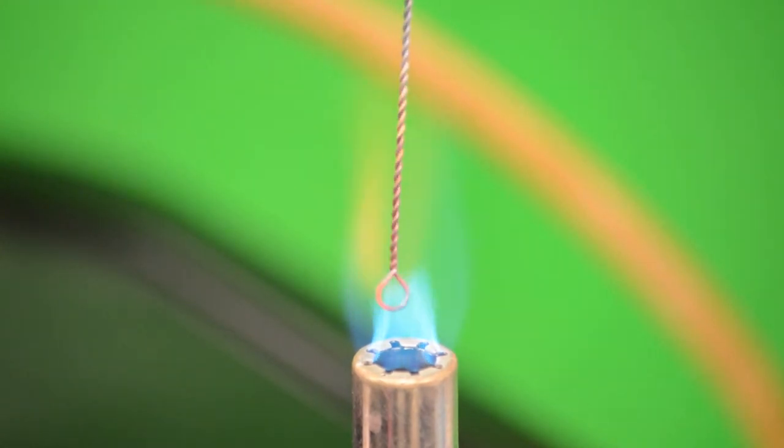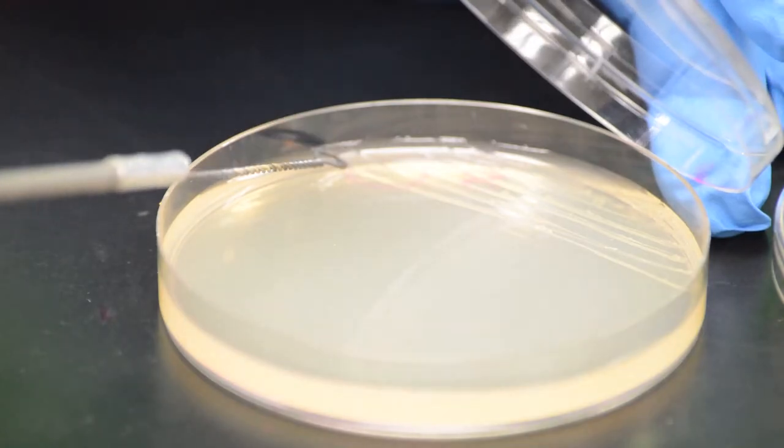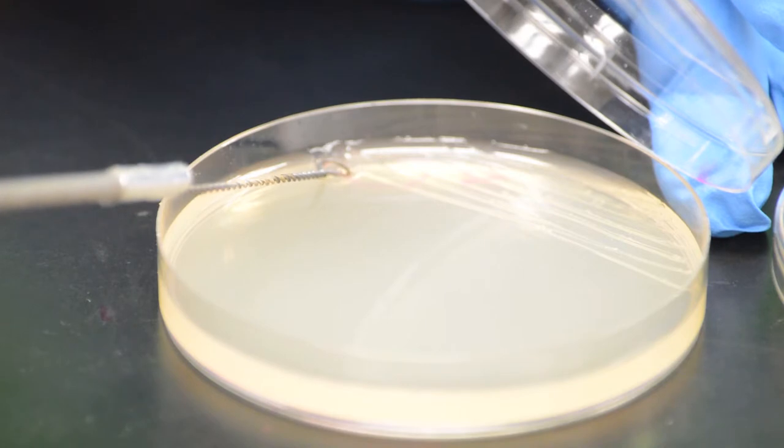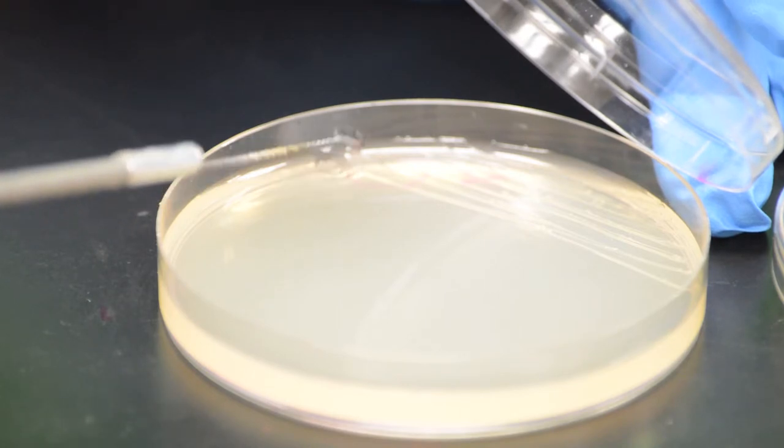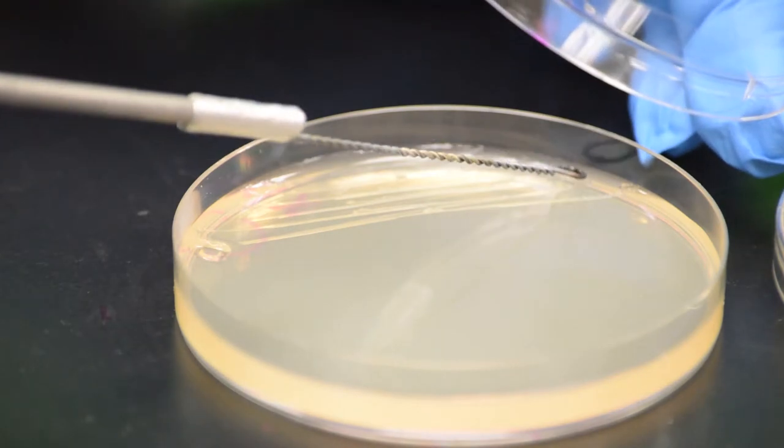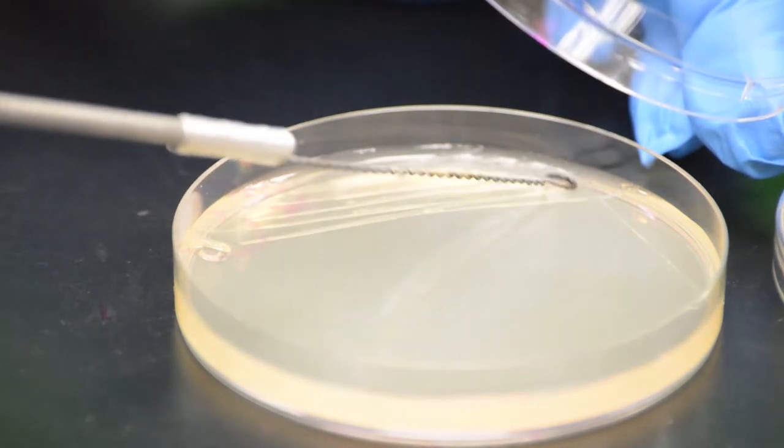Flame the loop until it glows red hot and allow it to cool. Following the pattern shown, carefully place the cooled loop at the edge of the last set of streaks and, using a zigzag motion, spread the culture over the next quarter of the plate.